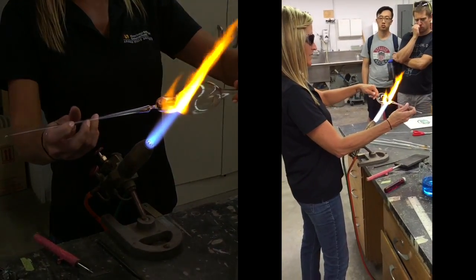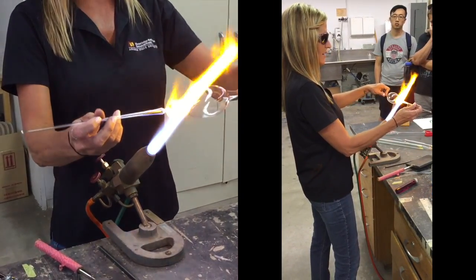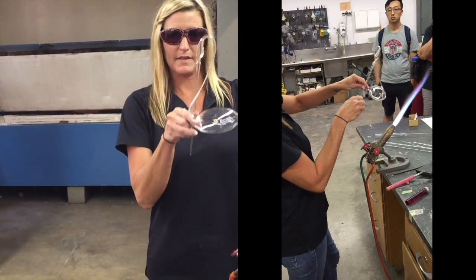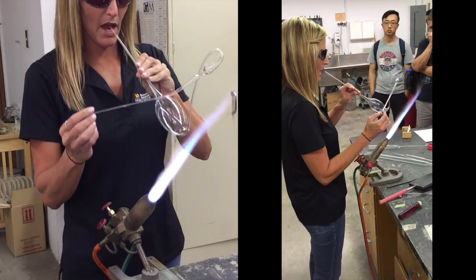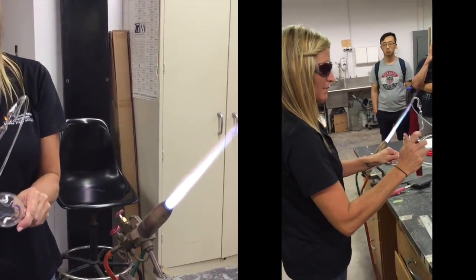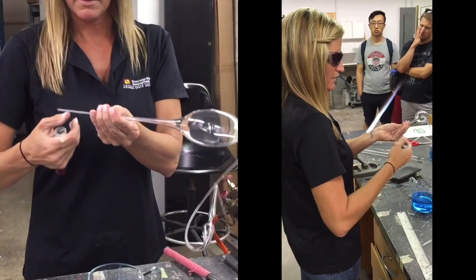A little bit for the head. All the same techniques I use every day to make scientific glass — when I made the body of the swan, that's the same technique to make a round bottom flask, except instead of stretching it apart, I would push it together. This is a knife made of tungsten carbide, and it just puts a little scratch in the glass, which allows me to break it off where I want.